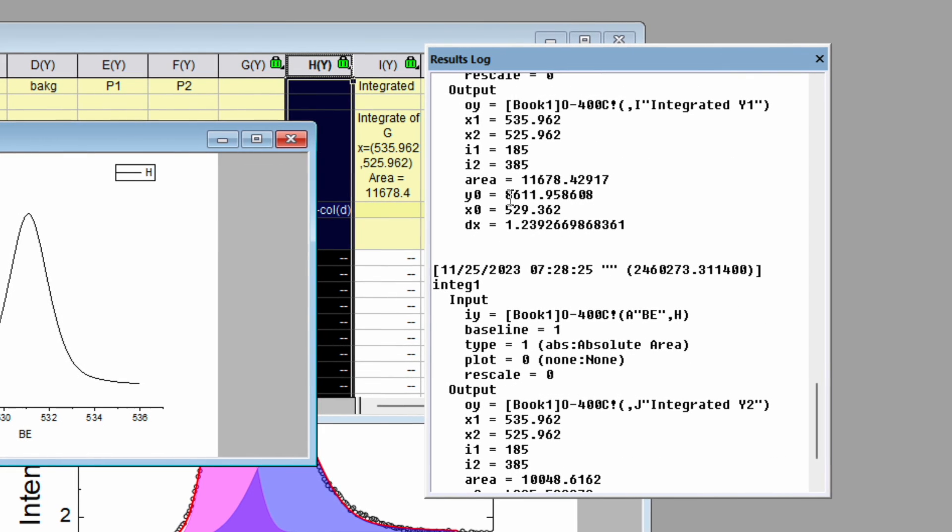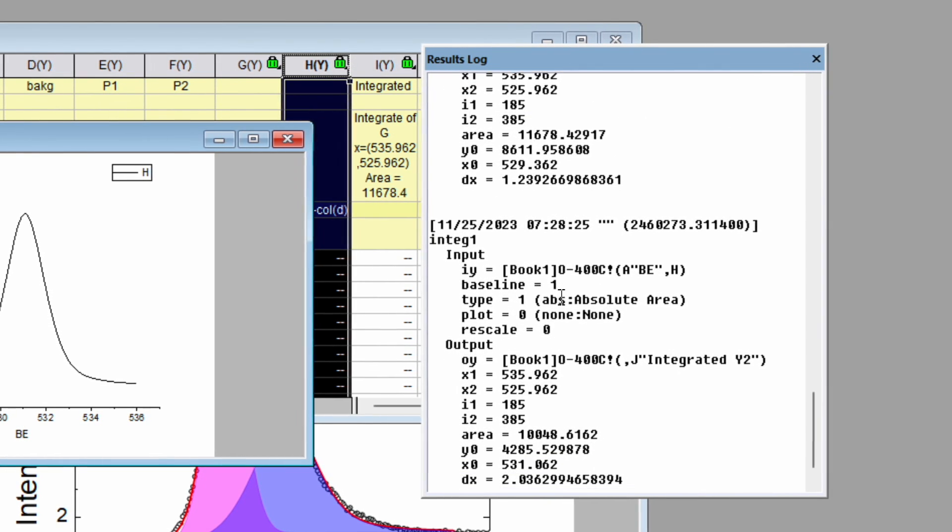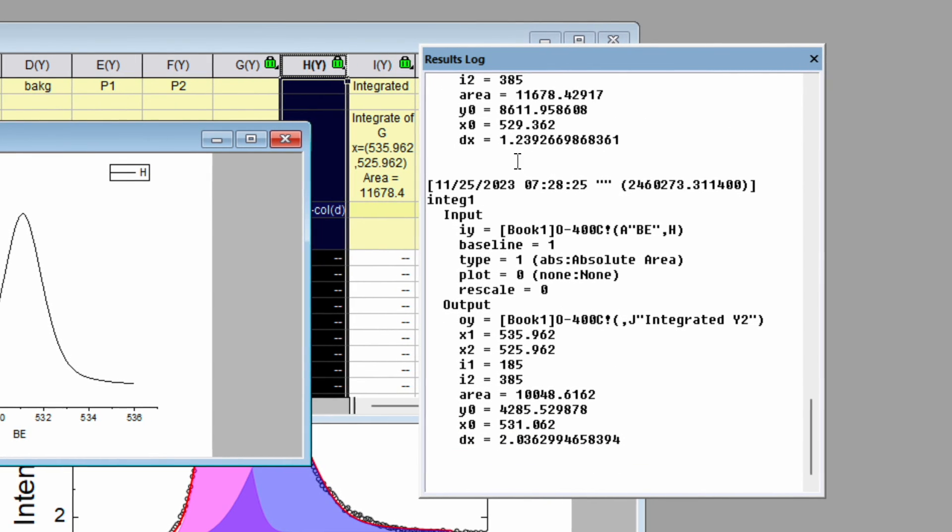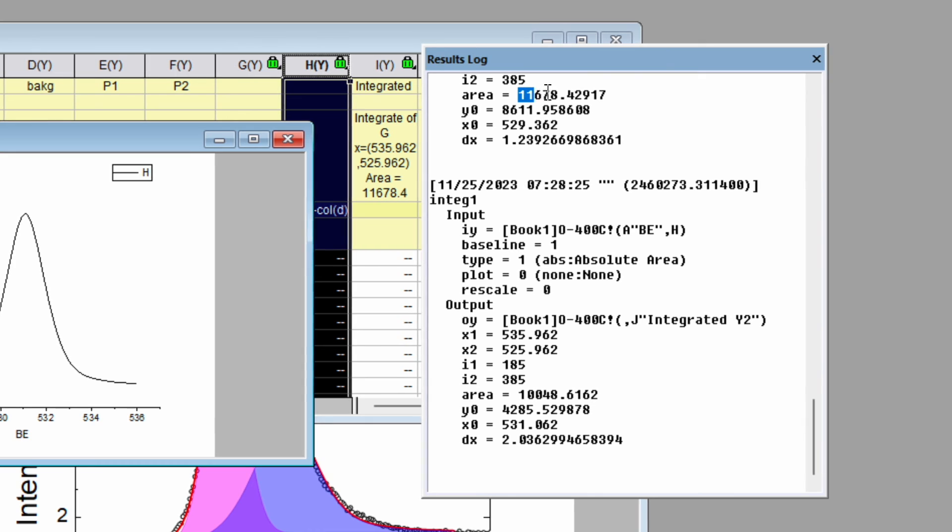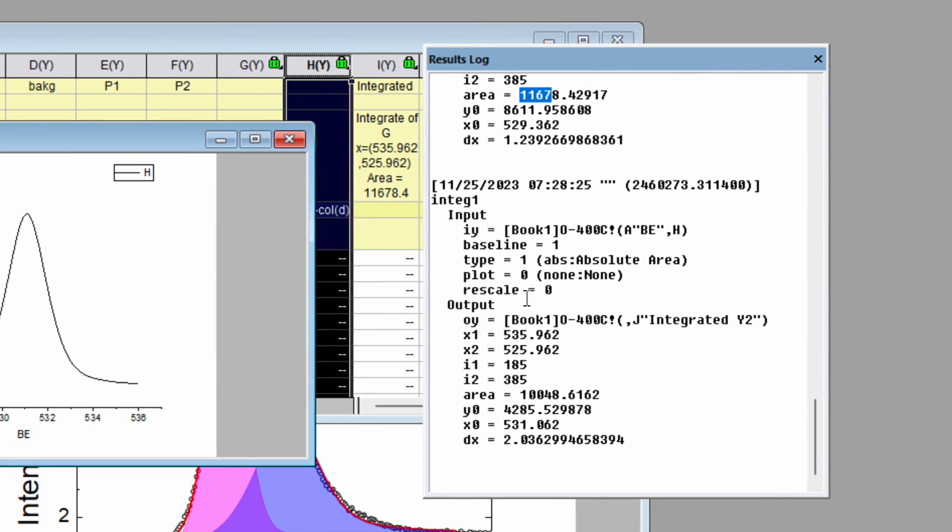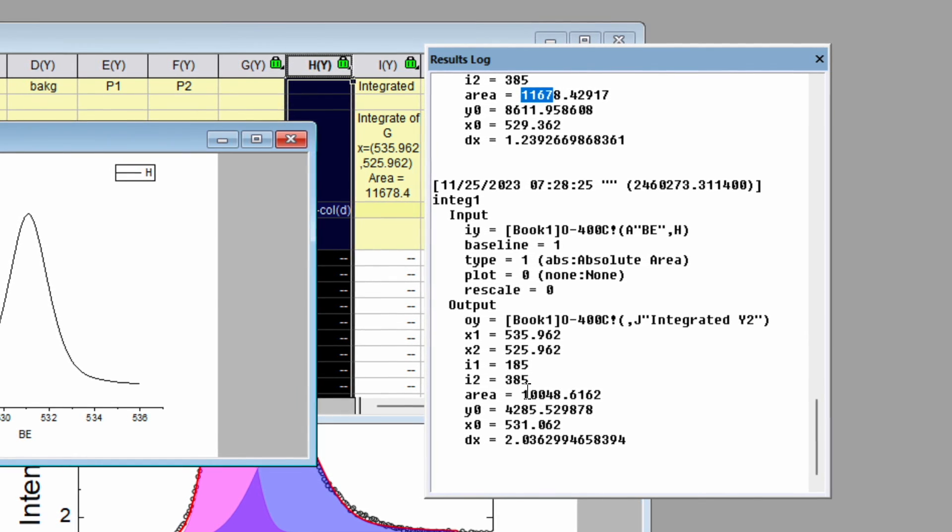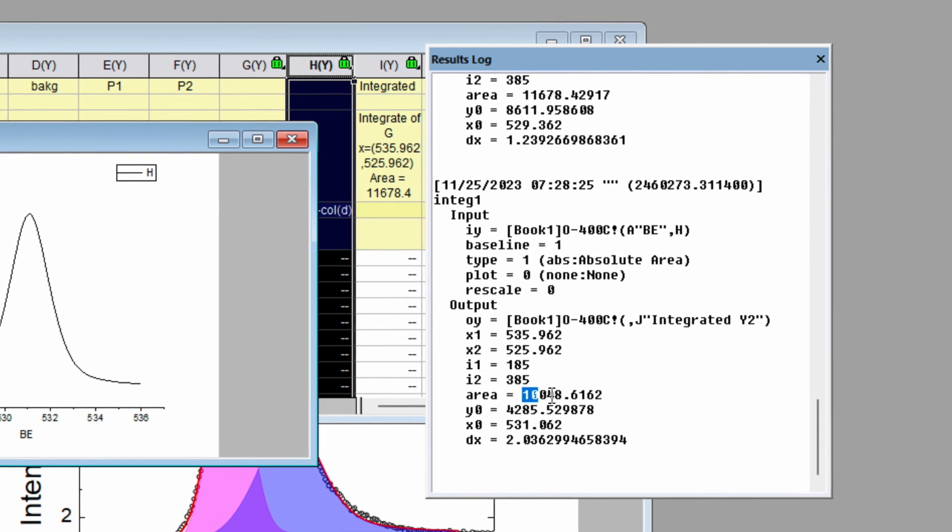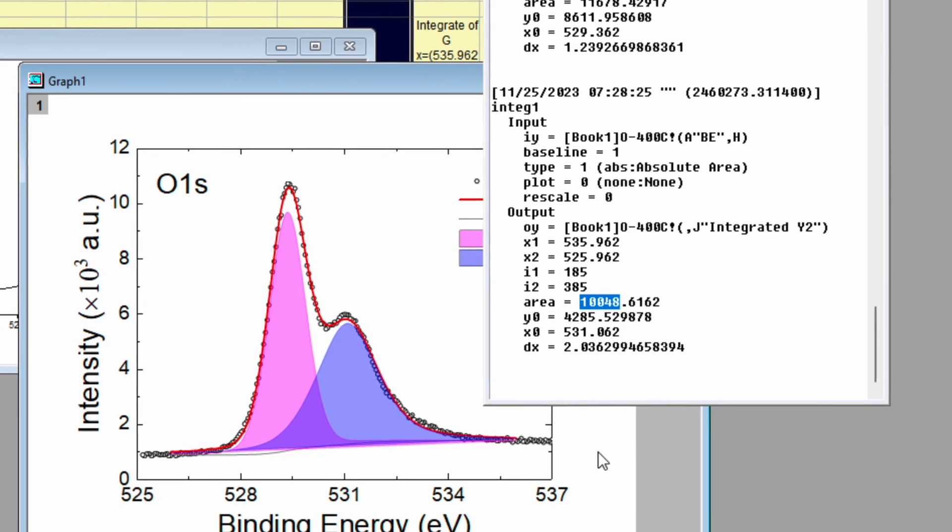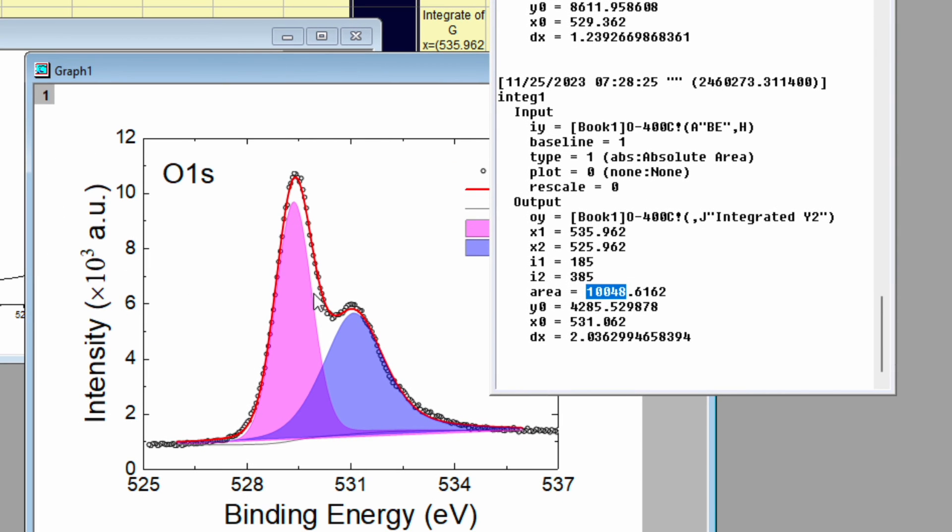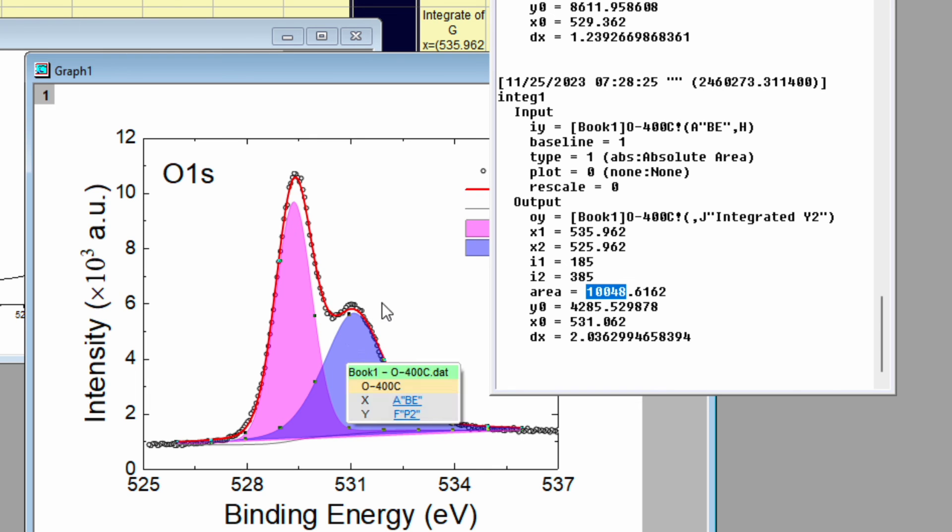The first peak area is 11678 whereas the second peak area is 10048. So from this we can confirm the area of the pink curve has a higher contribution to the XPS spectra than the blue one.